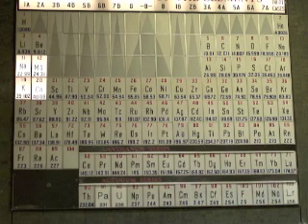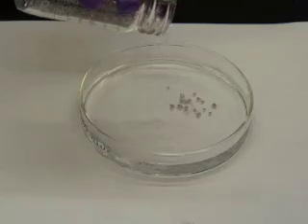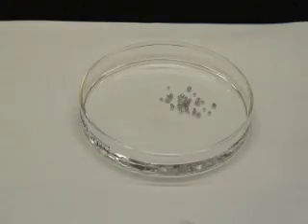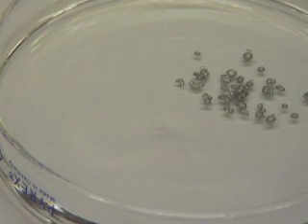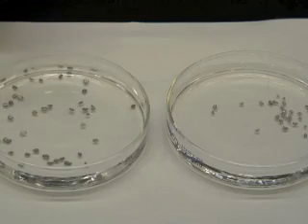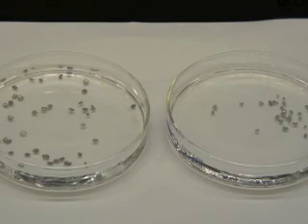Do you think that aluminum will react with water based on the observations? Let's find out. No, it does not react. Neither the magnesium nor the aluminum reacted with water. We will test both of these with acid to see which, if either, is more reactive.